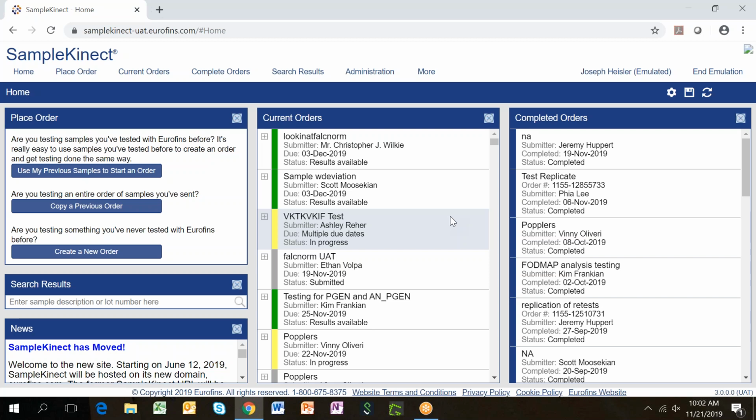SampleKinect submits information to our internal system, but there's nothing in the system that you can change with the work you're doing. So even if you submit an order by accident and you need to change it, or you decide you're not sending us samples, there's no issues there.